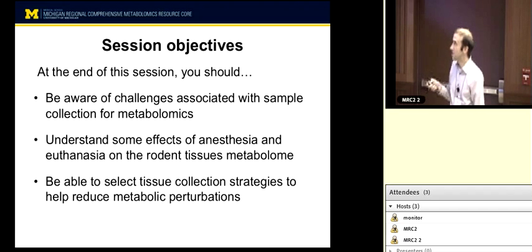And we did these standard methods of collection. A lot of people, when they're collecting tissues, will euthanize their animals by a standard method. Cervical dislocation is the quickest. They might use carbon dioxide or an isoflurane overdose, and just collect tissues after that necessary step is done. This results in various different times from initiation of the euthanasia to the time when you can safely collect tissues. Cervical dislocation is fast. That needs to be a specifically approved protocol if you're going to use it as your only method of tissue collection.